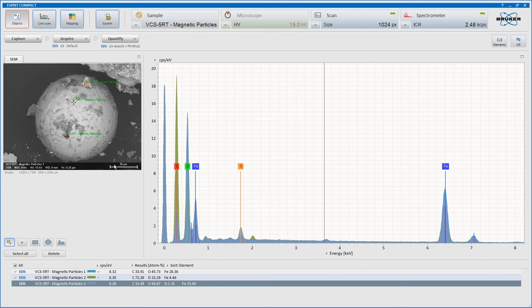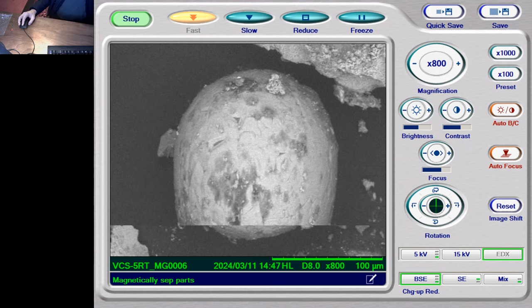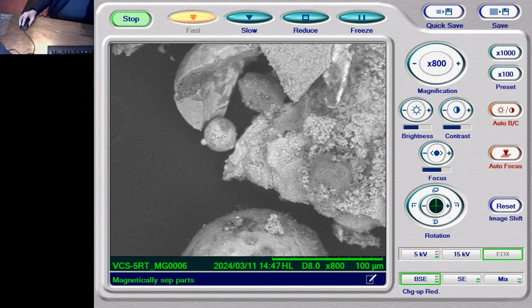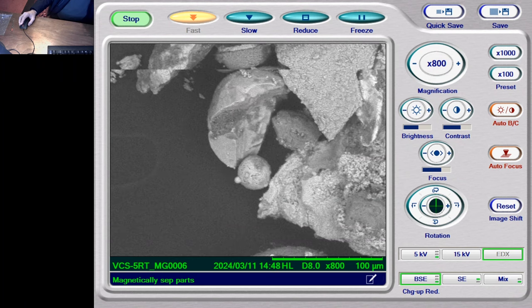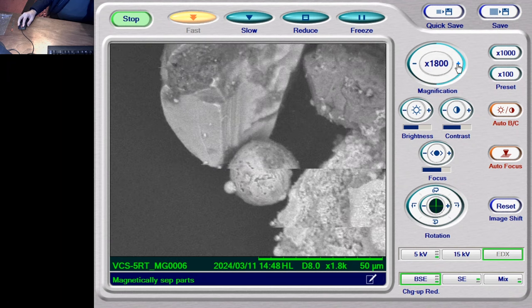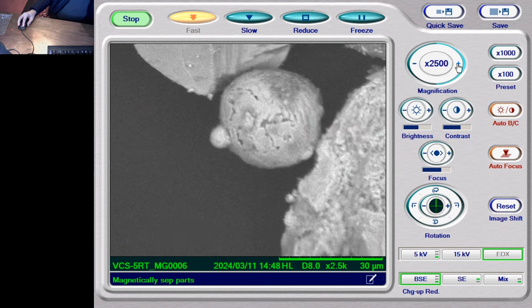There we go. So I think we should probably go and look at another area, don't you? So let's go back here. And we'll move around on the table and see what else we can see. Ooh, is that an iron-rich? Oh, there's an iron-rich crenellated sphere that's split. Maybe. Look at this one, though. This little puppy here. You go in a little bit more. I think we might get to see. It's got a little baby one off to the side. Look at that.